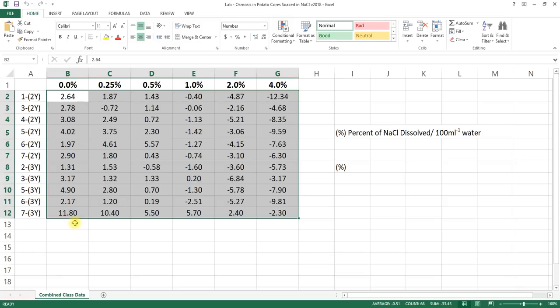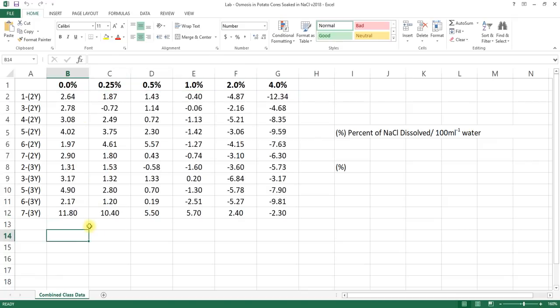These are taken from all the groups. All of these trials are what we call the dependent variable, what we're measuring. So before we do anything further, we're going to want to label our independent variable and our dependent variable. Let's go ahead and do that real quick.